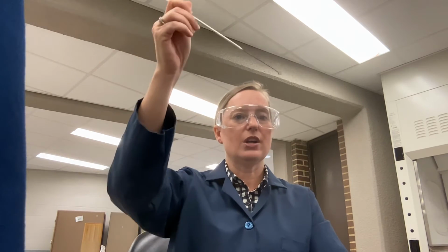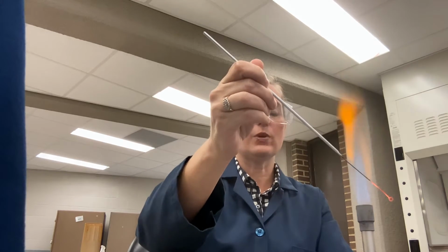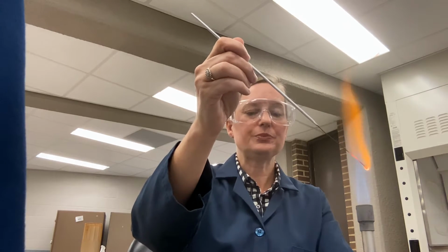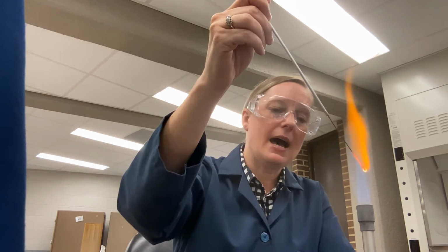So now we're going to take our loop, flame it again. So we're going to flame between each zone for 2 reasons. 1, we're trying to dilute each area because the goal is to get isolated colonies. And 2, we want to spread it out. So again, we're going to get the entire flame on the loop from top to bottom. And I usually say hold it like a pencil and then kind of dip it from the bottom all the way to the top. We're going to let this cool once again. I'm going to push this back just a little bit so you guys can see me a little bit better with this plate. And we're waiting for it to cool 1 more time.